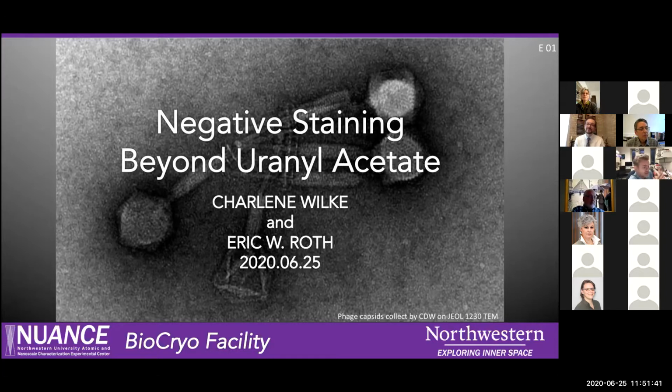Just a guess. That is a good idea, Dieter, but the point here is you need really very heavy atoms to get a good contrast, and that is why uranyl is still one of the favorites there. So with zinc or iron, I think your contrast would probably not be sufficient. Yeah, that's a good point. You do really want a high Z number element in there for the electron beam to interact with, to give you more inherent contrast.